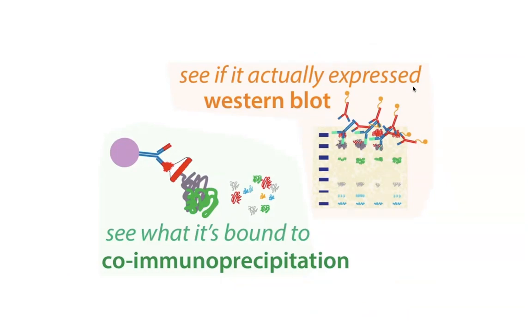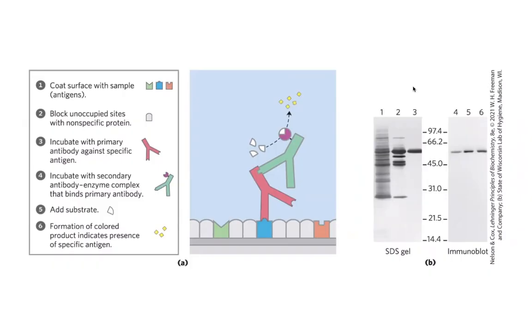So if we attach those antibodies to, say, beads, we can do this thing called a co-immunoprecipitation, where basically we use the beads, we pull on the beads, such as with a magnet, and then this is going to capture our protein as well as anything else the protein is bound to. So we can look and see what that protein was binding to. So we'll look at examples of how to interpret the results of these, as well as the theory behind how they work.